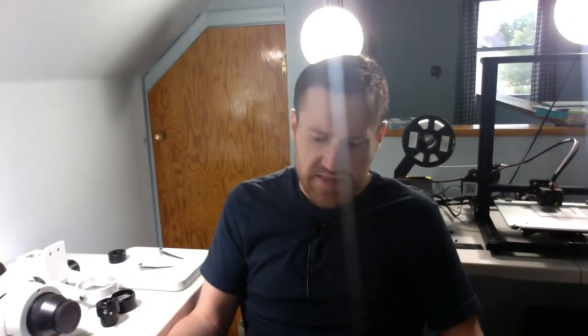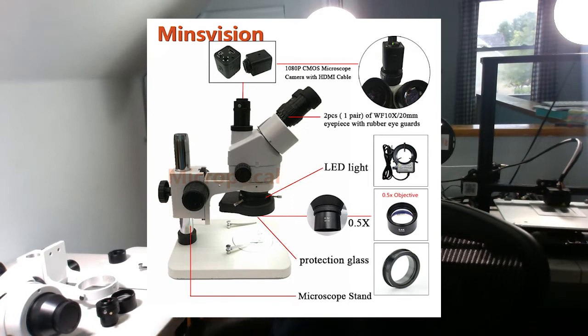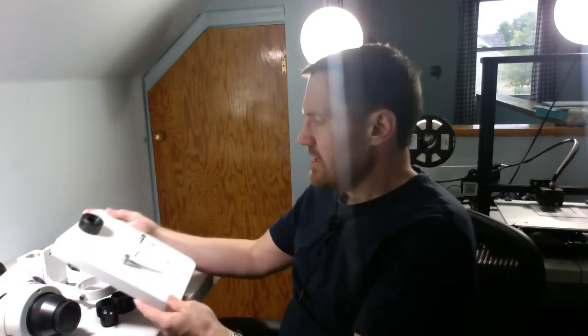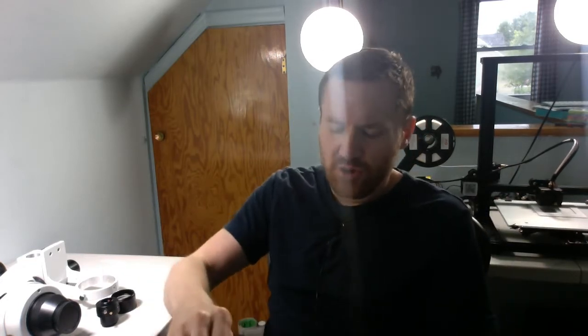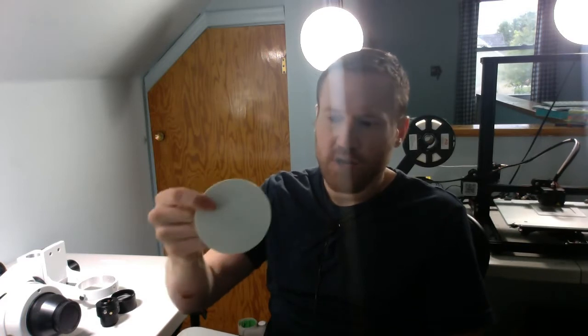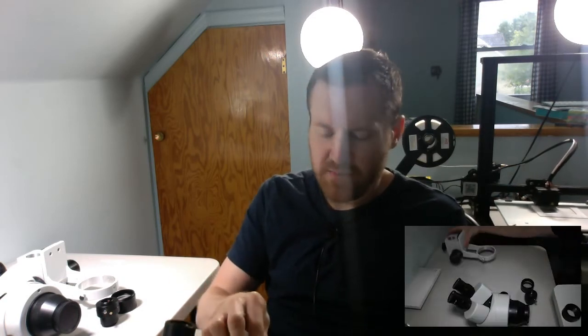Let's go ahead and take a look at assembly. The manual included is all in Chinese, which made for a little bit of creative assembly. Fortunately, the website does have a much better diagram. Starting out, we have the microscope base. They do have interchangeable bottom plates — you can swap for black and white, which is a nice touch, as you get better contrast against some materials.